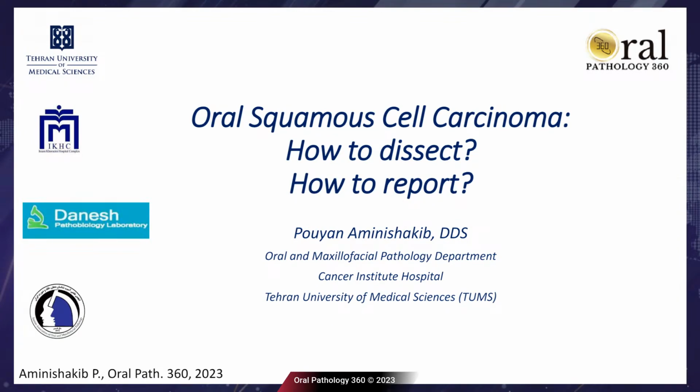Hello, everyone. I would like to express my sincere appreciation to Dr. Mandana for her kind invitation. It's a great pleasure for me to be here with you, and I will share some highlights about oral squamous cell carcinoma, about the dissection and reporting of oral squamous cell carcinoma cases.